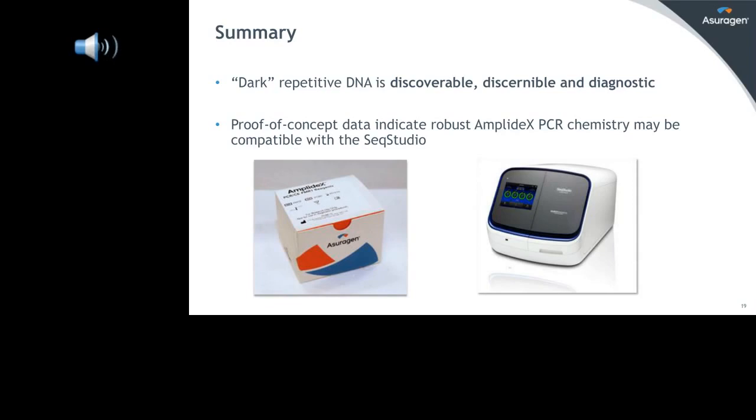So I think within those set of variables, you have a lot of design space to be able to come up with preferred parameters for your given assay. And just working within those, we found that that gave us a lot of latitude for how we can make sure we're getting the best possible results that would allow us to accommodate the different needs of each of these assays.